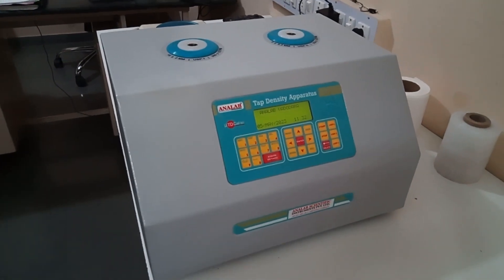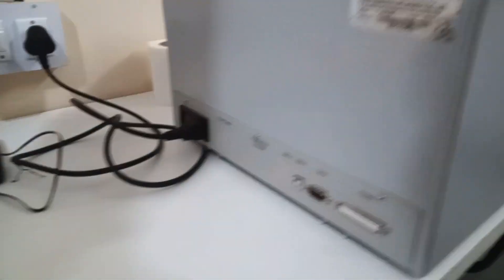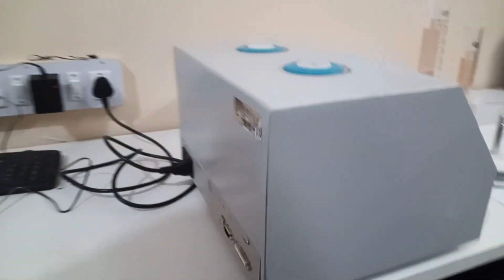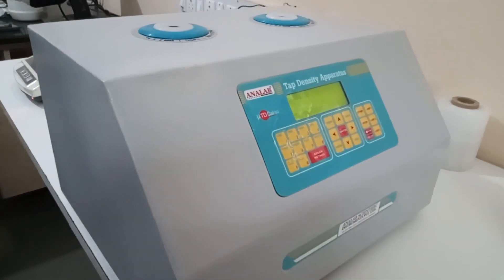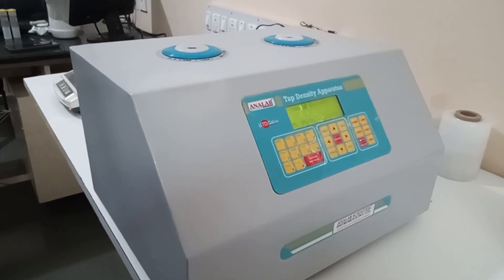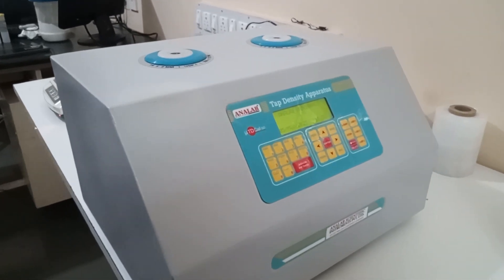Now let us install all the accessories with the main instrument. First of all, plug in the instrument with the main supply. Please check that the power supply should be 230 volts AC, having a proper ground — there should be less than 3 volts between neutral and earth point. It is very essential to have 3 or less than 3 volts between earth and neutral.